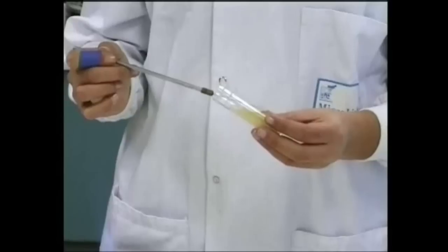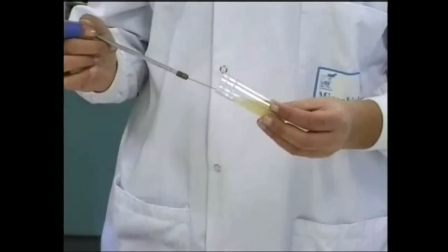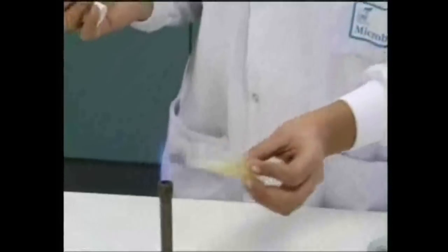The slope bottle is then opened and flamed and inoculated by drawing the loop against the surface of the agar, starting from the bottom of the slope and moving the loop from side to side towards the top. Once that has been done, the bottle neck should be flamed and the lid replaced.